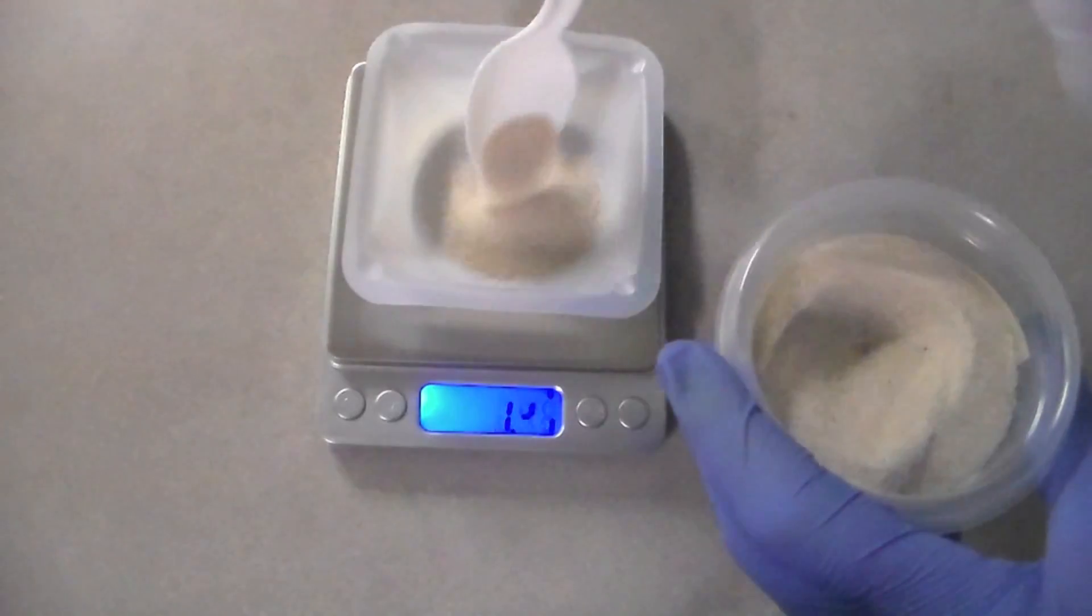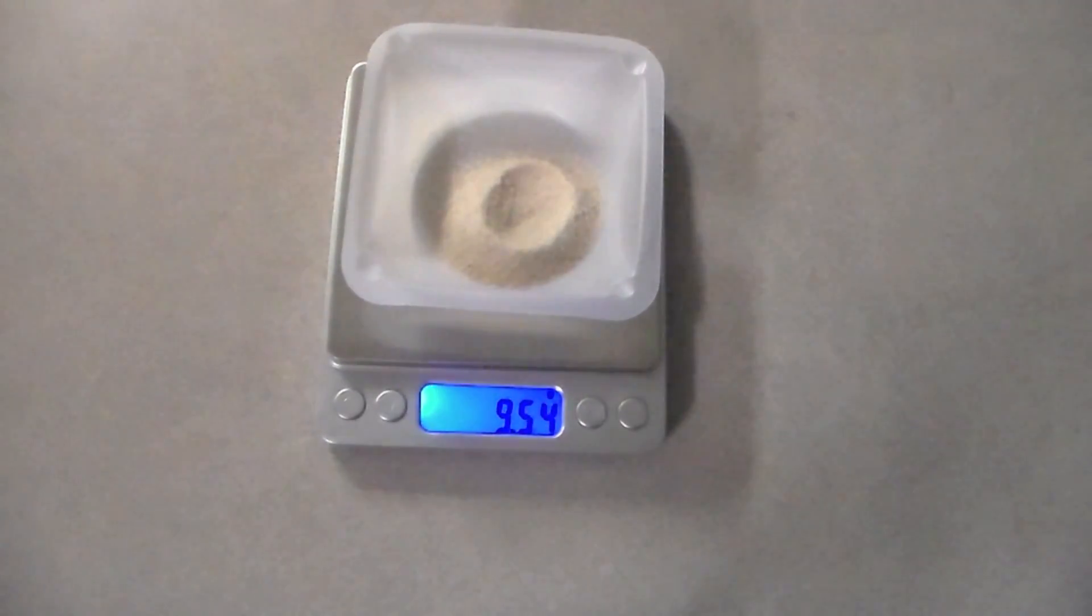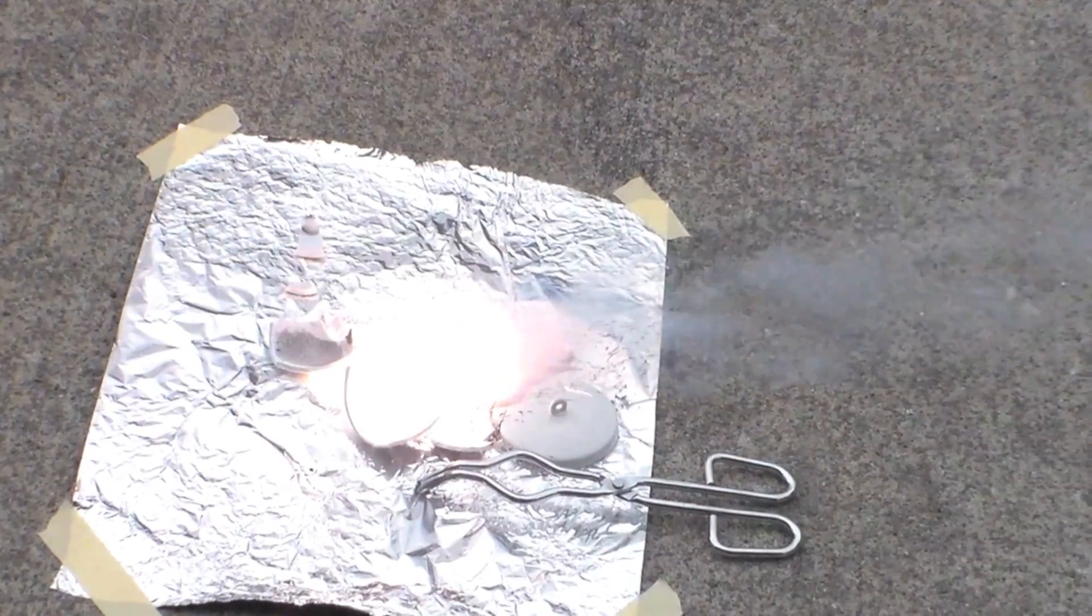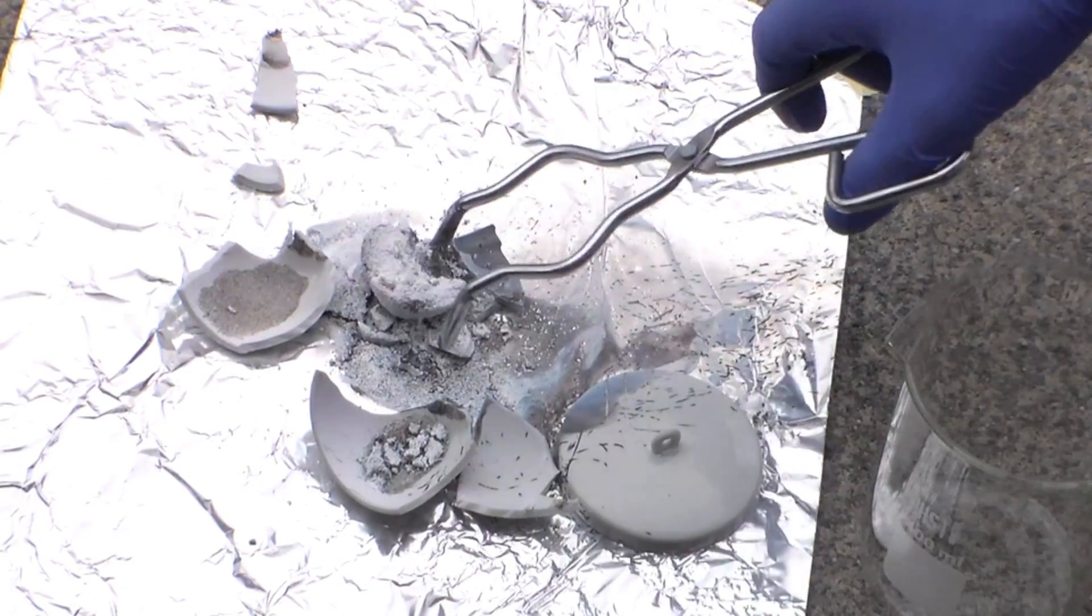I figured that by instead using an excess of silicon dioxide, we could prevent the silicon formed from reacting with excess magnesium. Thus, we should theoretically be left with some silicon in the products.